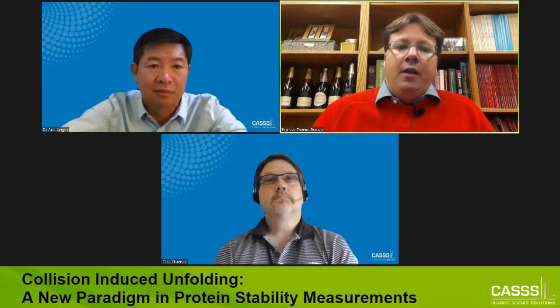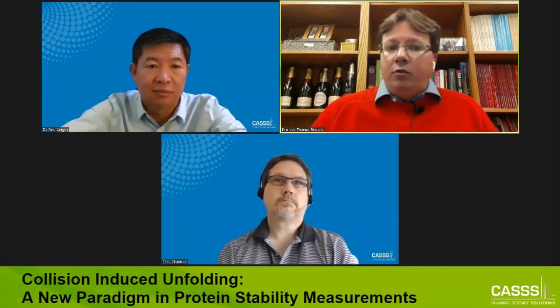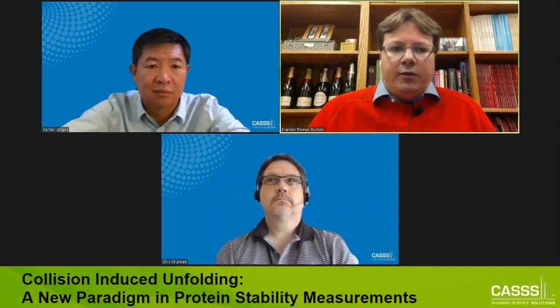And like I said, you have to take the mass spectrometry measurement very carefully in order to get it in a comparable state. Looking at low concentrations is very important for doing it in the right way. But if you do it, I think the correlations between SEC and ion mobility mass spectrometry are very strong, typically for quantifying oligomers. I've not done so many correlations with AUC, I think, but my guess is that would be a similar story there. So yeah, I think that this form of mass spectrometry has a lot of growth potential, really, when you think about quantifying oligomeric populations in antibody stress states, formulations, and so on. Yeah, that's an area my spec never touched before.